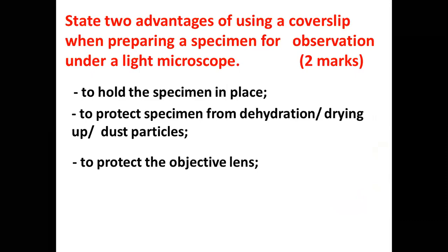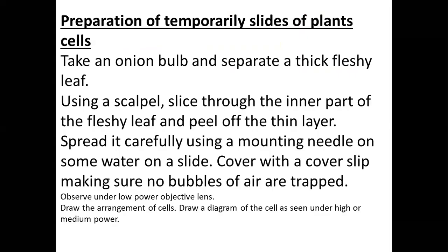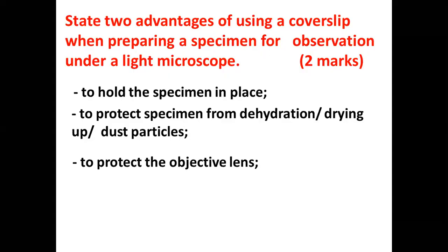Reason, the specimen could have stain, it will have some water, and it also has impurities, which in case for some reason the objective lens happens to touch inadvertently, the objective lens can be stained. And once you are dealing with a stained objective lens, you will see nothing. Now, I think that one is okay.